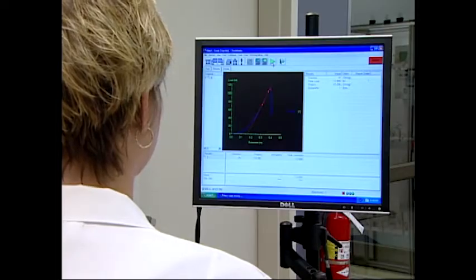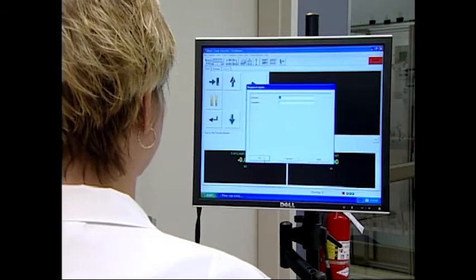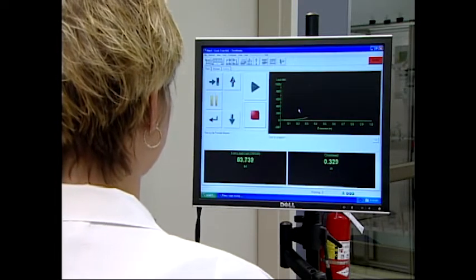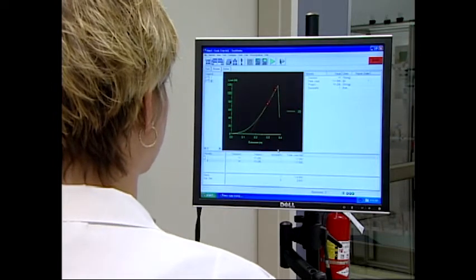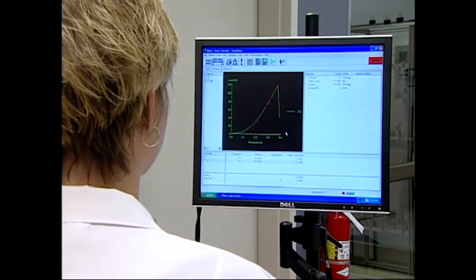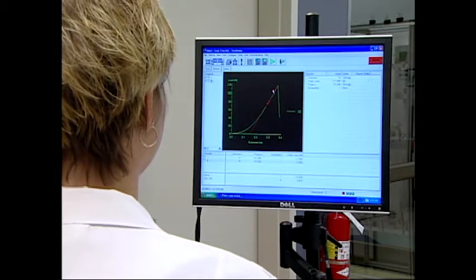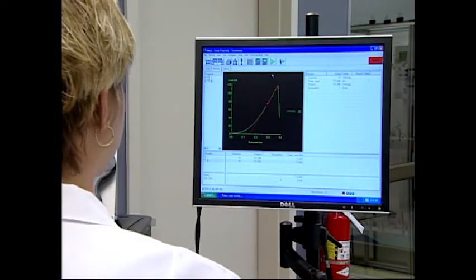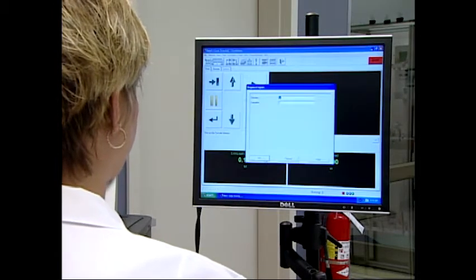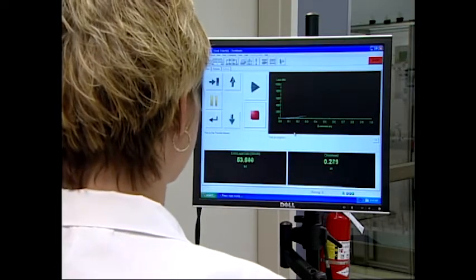Whether the tensile test is the grab or strip method, the breaking force and the elongation at stretch are measured and recorded. As the specimen is being loaded with the force necessary for breaking, the data is collected and reported. A real-time graph is plotted on the instrument's monitor at the end of the test. This graph is referred to as a stress-strain curve. The curve is a graphical representation of a material's resistance to deformation, stress, and its deformation or elongation caused by the force, strain.